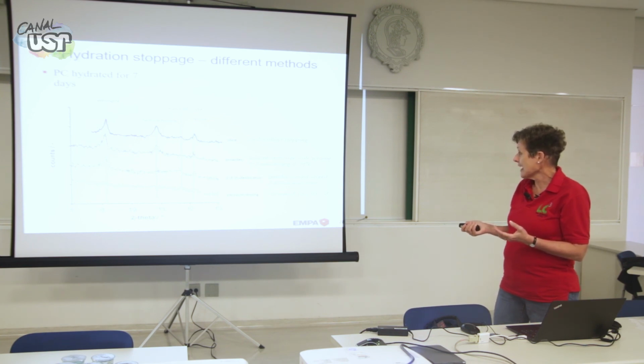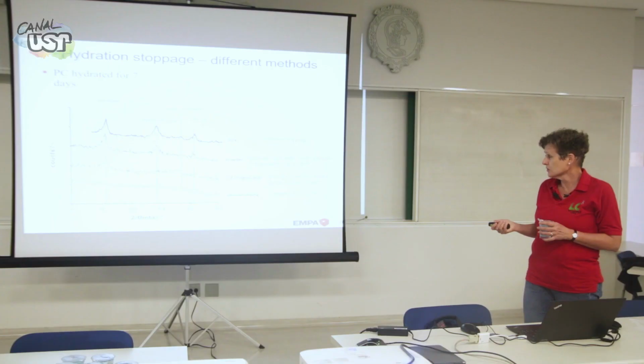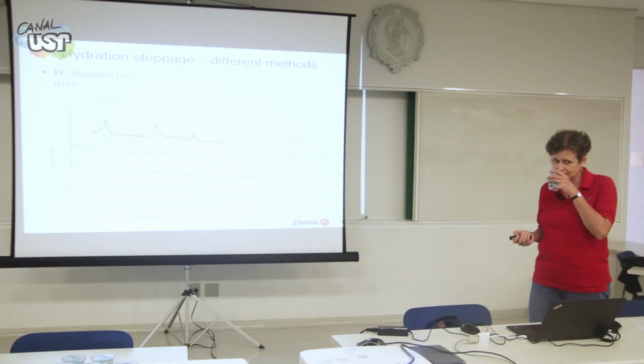And then if you've done vacuum drying, which is what a lot of people do, freeze drying is basically vacuum drying. You see, you completely destroyed all these phases. So these hydrates are very, very sensitive to the drying technique.